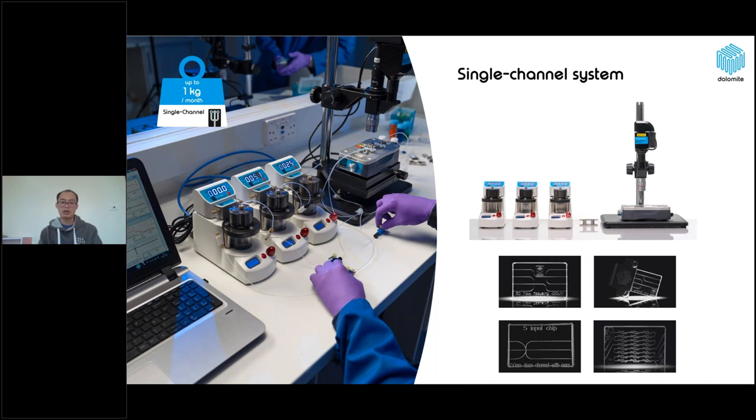the microfluidic chip. The system we designed is a modular system and it's very flexible. So the end user can add or remove each modular component to adapt to each specific application. That's why the system can be used for many applications by just using different modules and different chip designs.